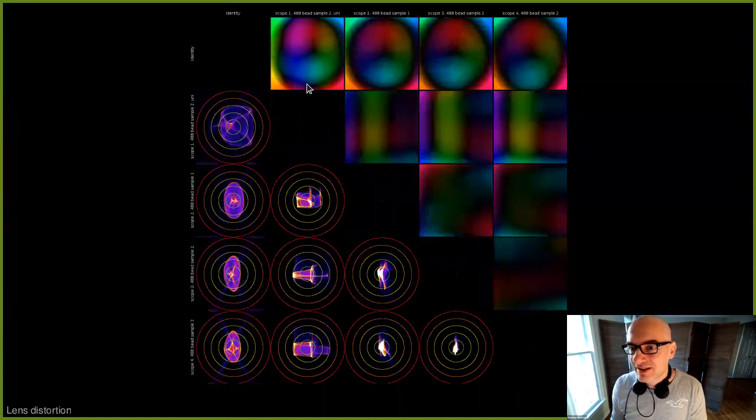Okay, so similar comparison when we look at microscope 1, 2, 3, and 4. So we have all different microscopes, and we see, okay, this is reproducible. So the difference is notable. It's more than when we're just in the same system.